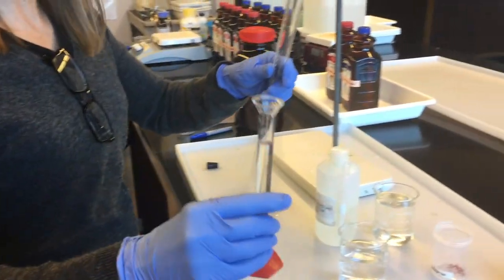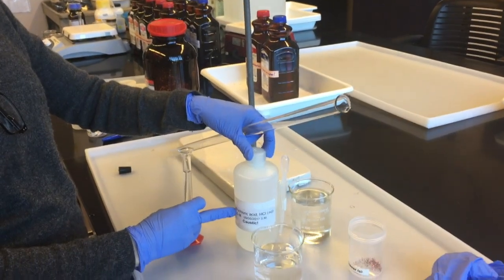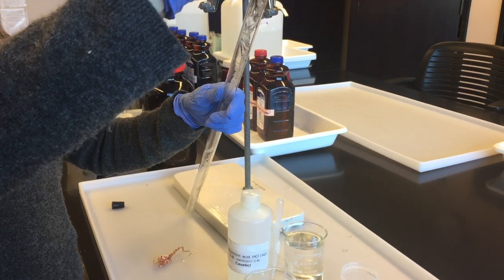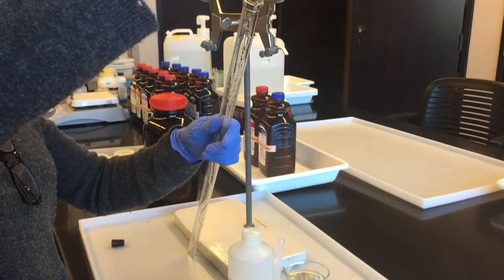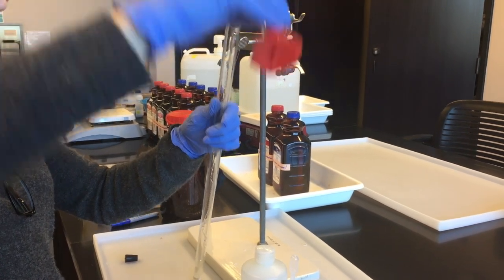First thing you're going to do is carefully pour the 10 milliliters of 6 molar hydrochloric acid that you measured out into the gas measuring tube. It's the thing going in the tube first. Make sure all the droplets get in.